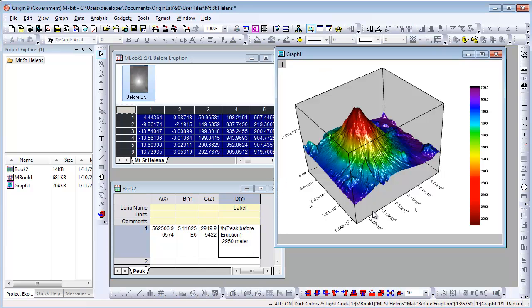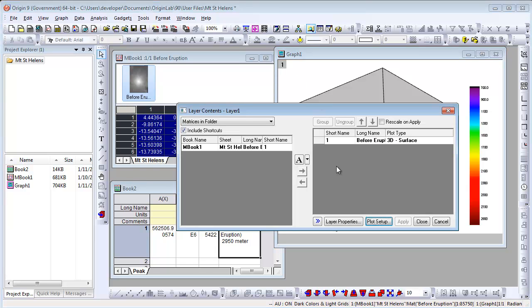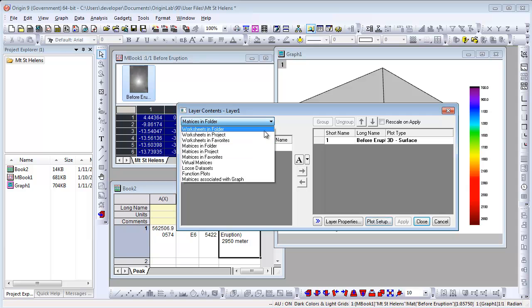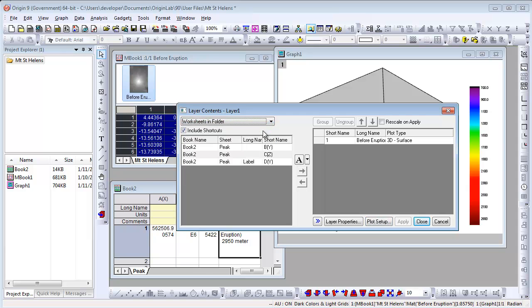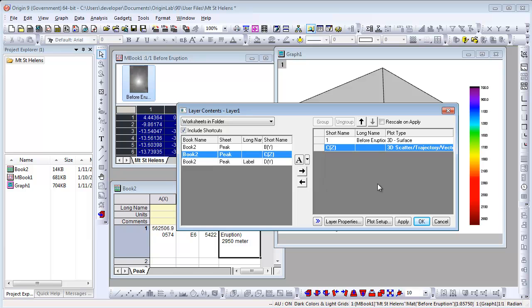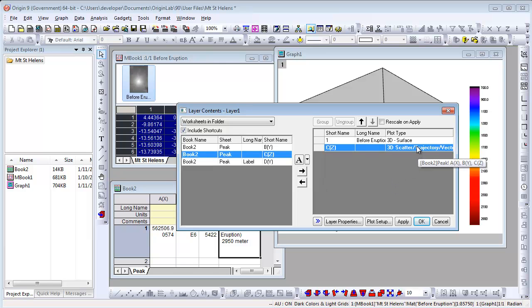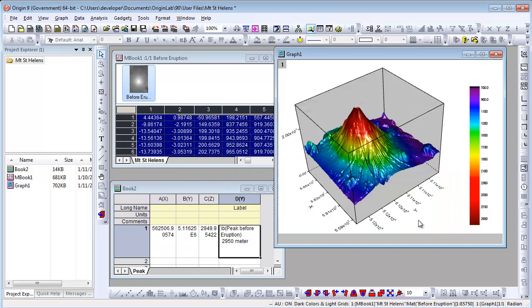To add data labels in this graph, we need to add a 3D scatter plot first. Let's double click the layer 1 icon to open the layer contents dialog. Choose worksheets in folder and move the Z data to the layer. The data is added as a 3D scatter plot. Click OK.